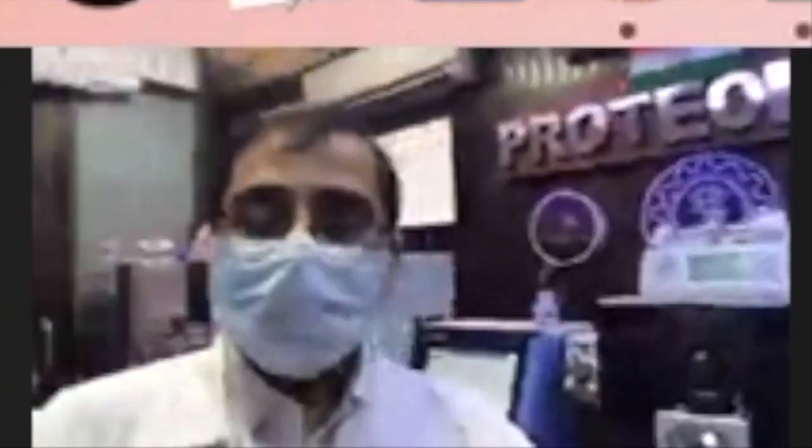All right, so we are here in one of the Proteomics mass spectrometry labs, where we have set up various high-end mass spec instruments, which we are going to use for different projects. Of course, you are going to see them as I talk to them in more detail. Just to give you some visual sense of what we are talking about: we have been talking about analyzing proteins and complex protein mixtures. Those could be processed here with the liquid chromatography interface.